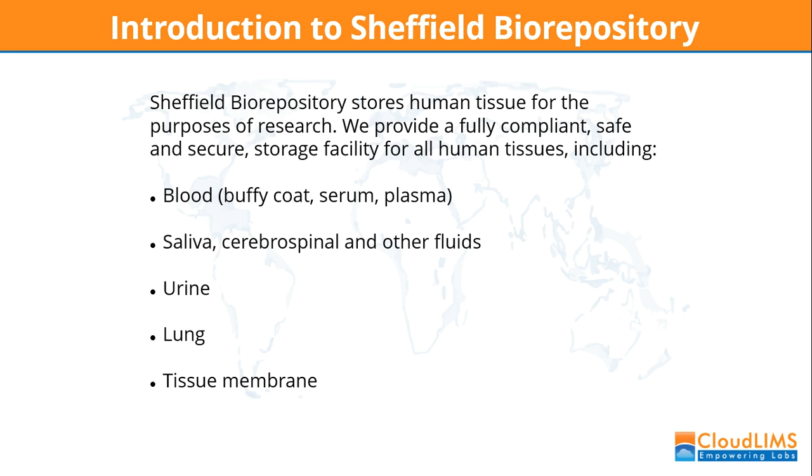Our biorepository in Sheffield was set up over 10 years ago to house all the collections in the medical school which fall under the Human Tissue Act. The Sheffield Biorepository itself is made up of a series of individual biobanks, looking at, in particular, bone metabolism, cardiovascular diseases, and also the Sheffield Institute for Translational Neuroscience has a vast collection of brain bank related material.